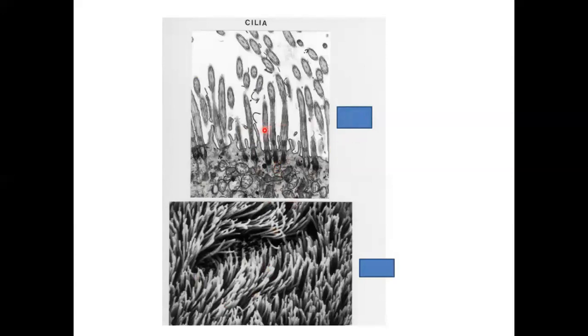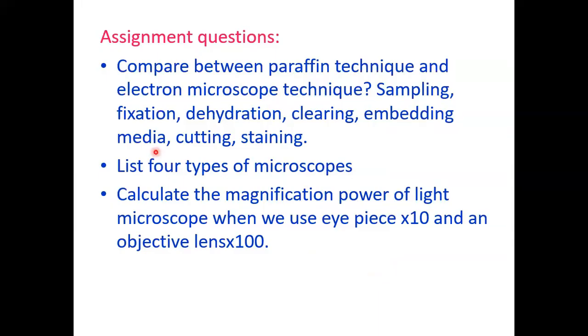I have the transmission electron microscope here, while here the same image by scanning, you will find the surfaces. This is the transmission electron microscope, and this is the scanning electron microscope.